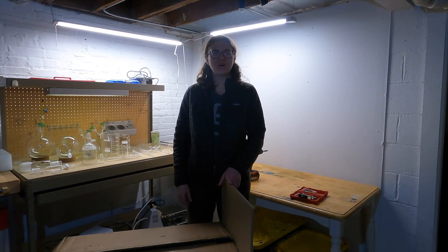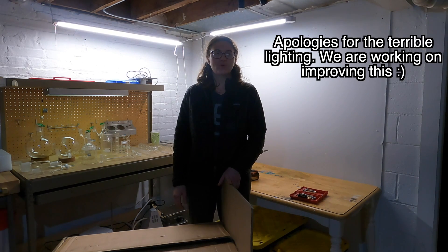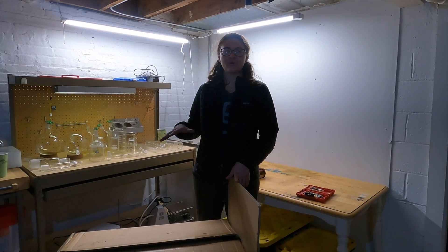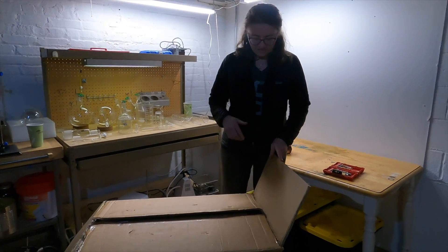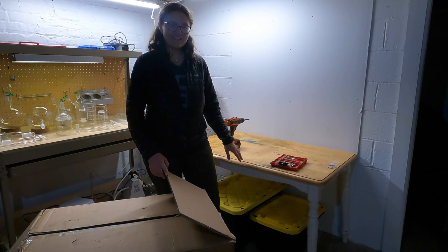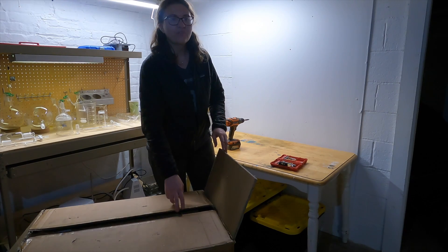Hey friends, welcome back to Wrought Iron Farm. Today we are unboxing the new rotovap — we got it from Vivor. We are moving the lab from one basement to another, so we moved all the glassware and everything. Now we're going to unbox the rotovap. This was an old art table that we used to use for painting, so it's got the artistic flair, but that's going to be what we set the rotovap on.